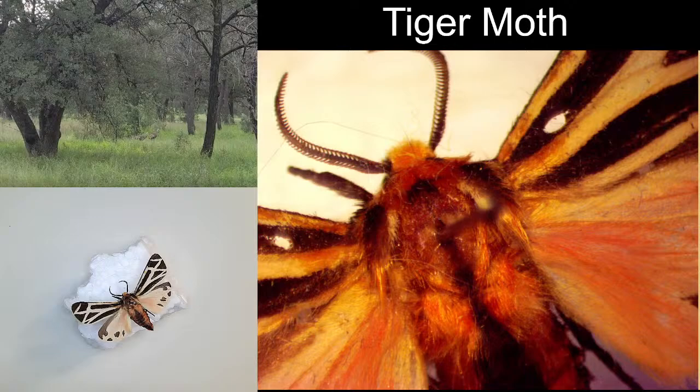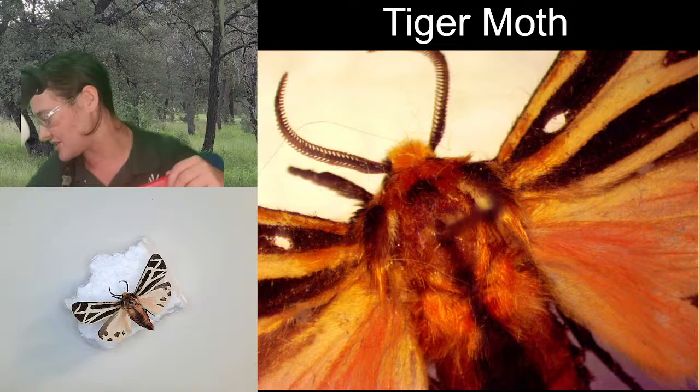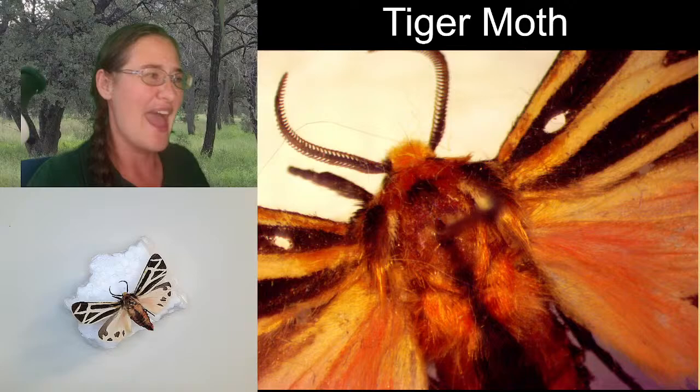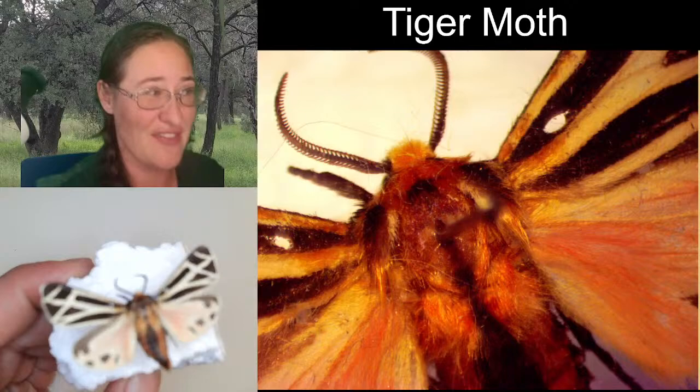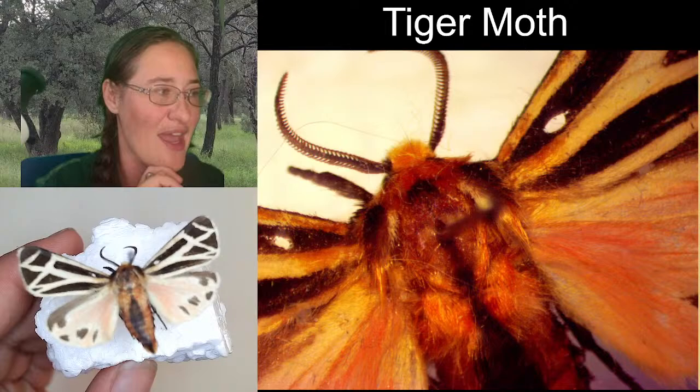I will admit that I'm not sure of the exact species that this specimen is. I do know it down to genus, but there are a couple of species within that genus in the range that it was collected, and the differences between the individual species, from what I could tell from a quick look, was the spotting patterns on the hindwings, and they can vary. So sometimes there are certain species that have more or less spots, but then they vary within, so it could be a couple of different things.